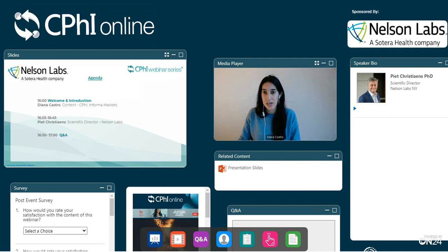So here's today's agenda. This webinar will present you a true understanding of the interaction mechanism between a lyophilized drug product and its container, as well as provide you with an understanding of an extractable and leachable study design for a lyophilized drug product.